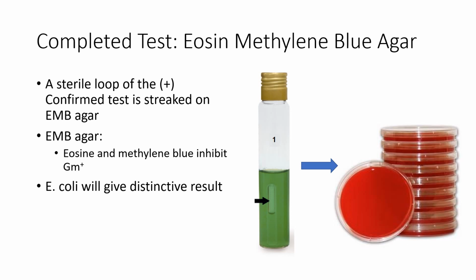Now, we just did mannitol salt a minute ago, and it might look from these images that they're the same. They're not. This EMB is actually more purpley, and mannitol salt is more orange pink. So I'm sorry if they seem like they're the same. If you saw them side by side, you would not confuse them.